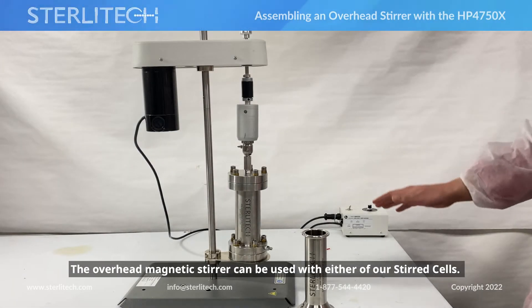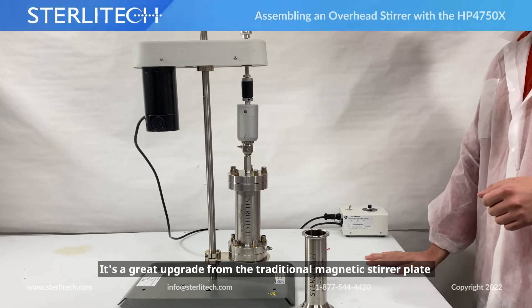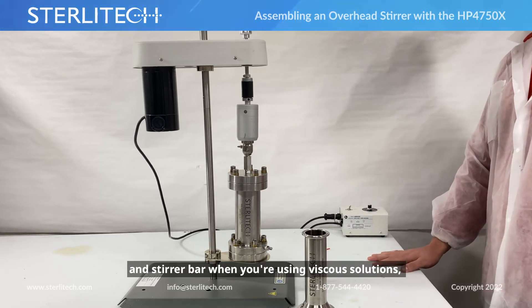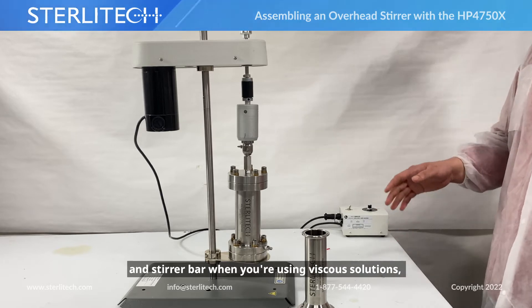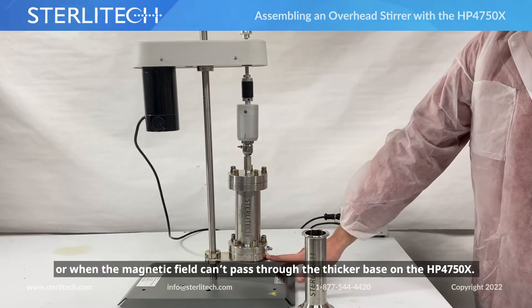The overhead magnetic stirrer can be used with either of our stirred cells. It's a great upgrade from our traditional magnetic stir plate and stir bar when you're using viscous solutions, or when your stir plate doesn't have enough power to get through the thicker base on our HP4750X.